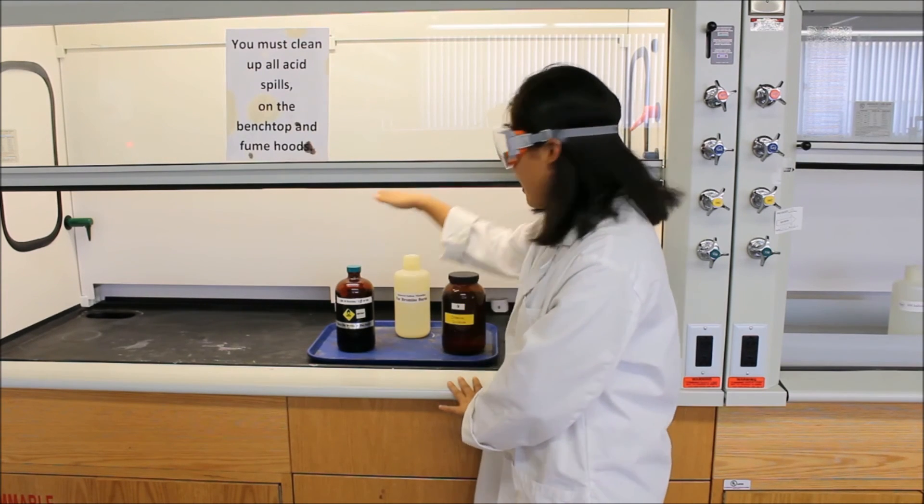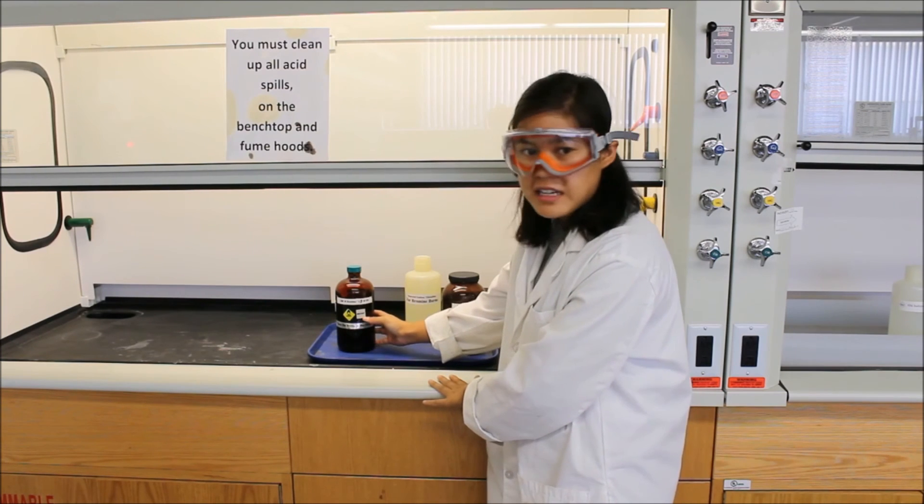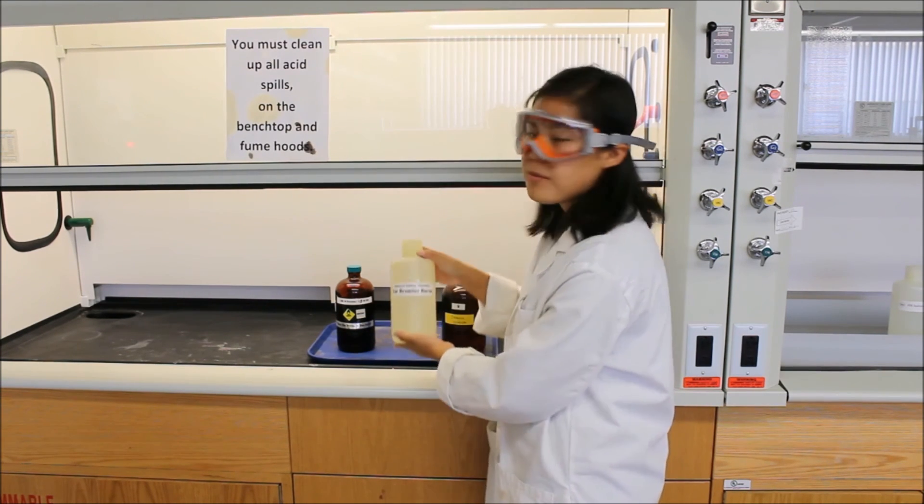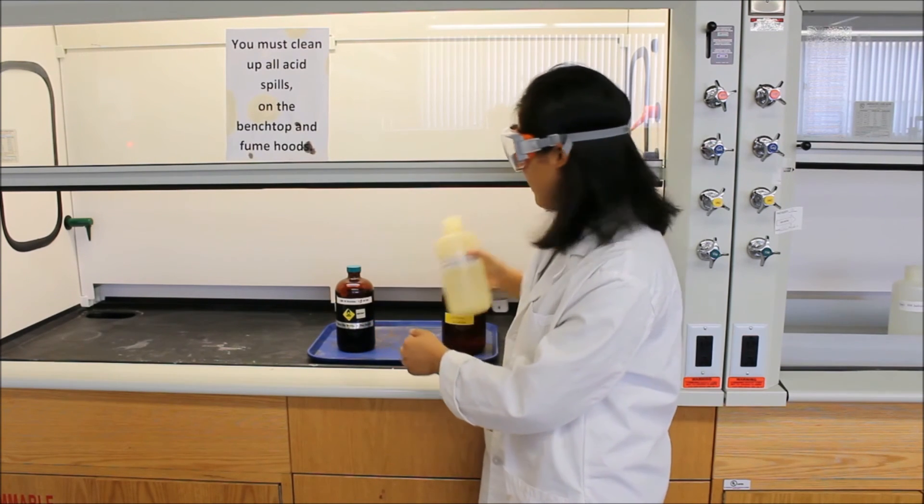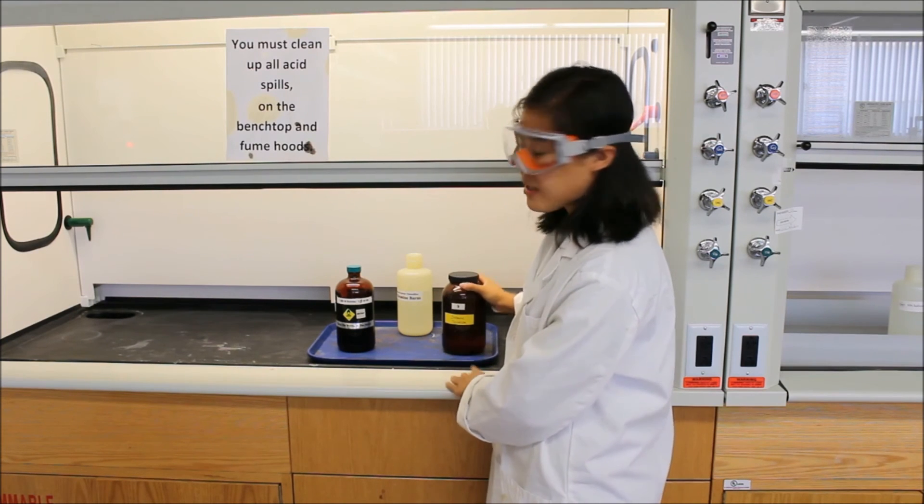So if you spill any of the bromine on yourself, remember it's an irritant and it's a strong oxidizer. So you're going to want to pour some of this sodium thiosulfate solution on where you were burnt and then rinse it off in the sink like anything else that you spill on yourself.